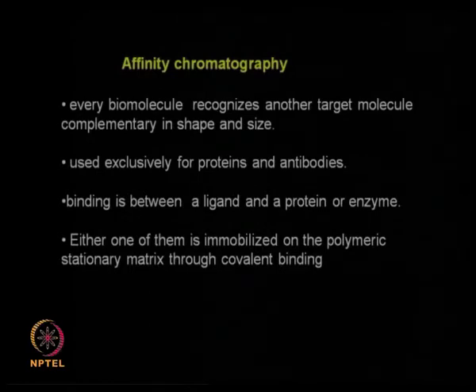Affinity chromatography is the most perfect chromatography among all these techniques, and it is very selective, unlike the other types of chromatography. That is why it is a very expensive tool, used in highly expensive biomolecule separation, maybe pharmaceutical products and so on. It cannot be used for normal bulk chemicals because the cost of affinity chromatography is very high, and it is a very exact type of technique.